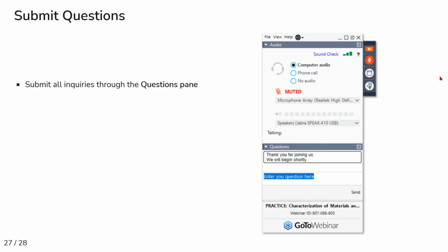And for the sake of time, one last question: apart from continuous tomography to increase the throughput of your tomography data collection, what other technological developments do you think would have the biggest impact on increasing the outcome of your study? When it comes to the collection side, I think a big thing is bigger and faster cameras. If we have a bigger camera, we can collect a much larger area in the same amount of time. And if the camera is faster, we can use a higher exposure and also collect in less time.